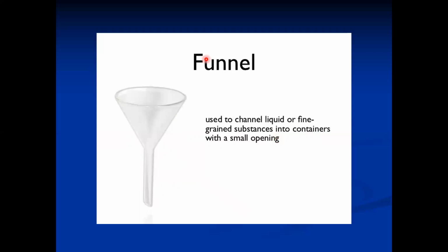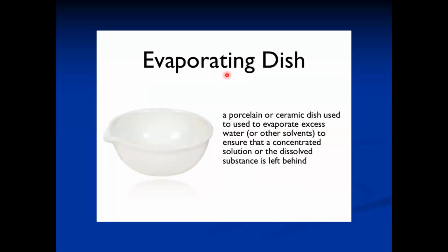Funnel, it is used to add liquids to any other container. It is used to channel liquid or fine-grained substance into a container with a small opening in order to prevent spillover or loss of that liquid or solids. Then evaporating dish.